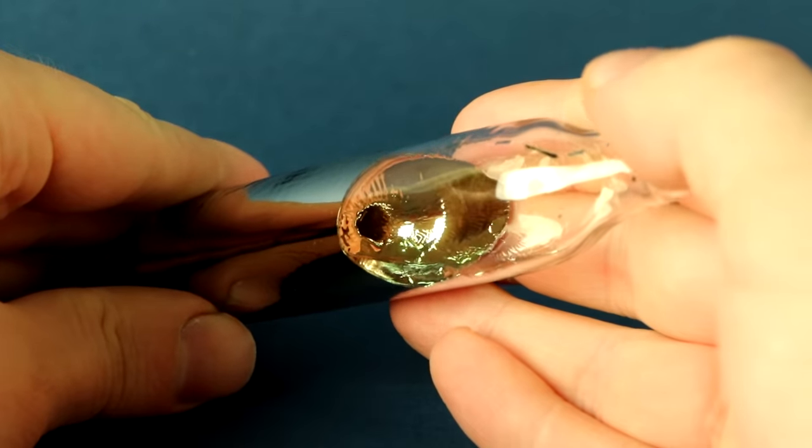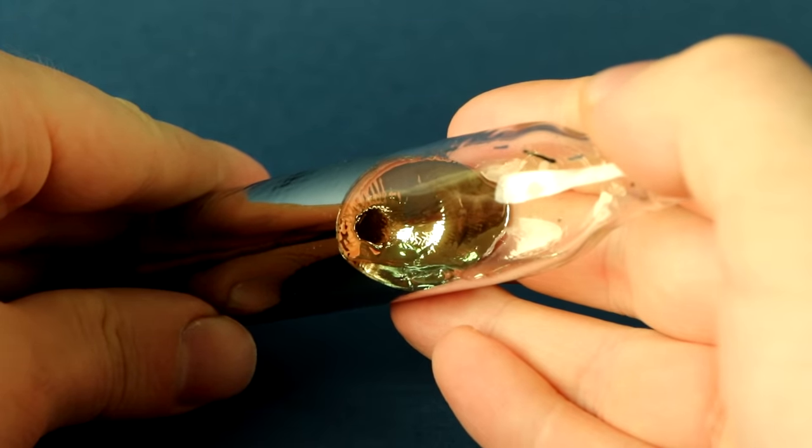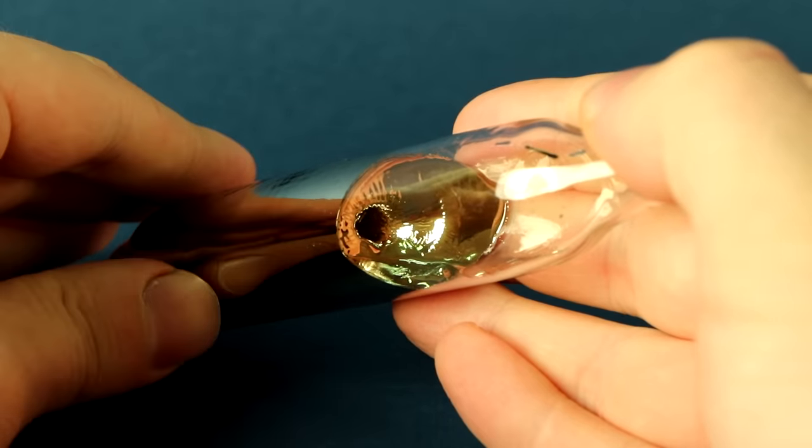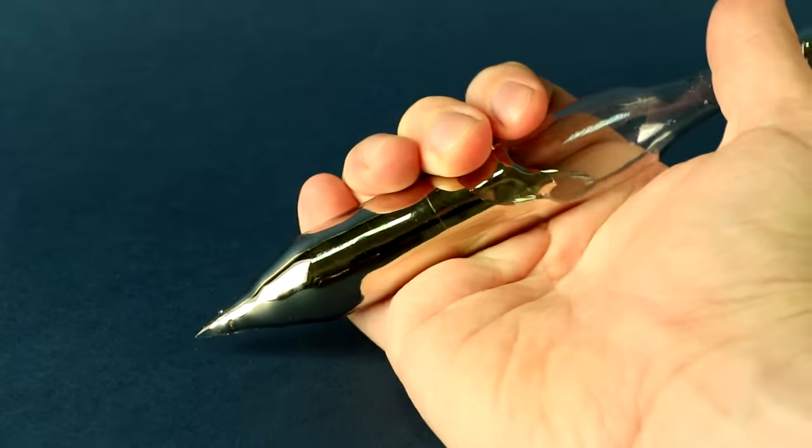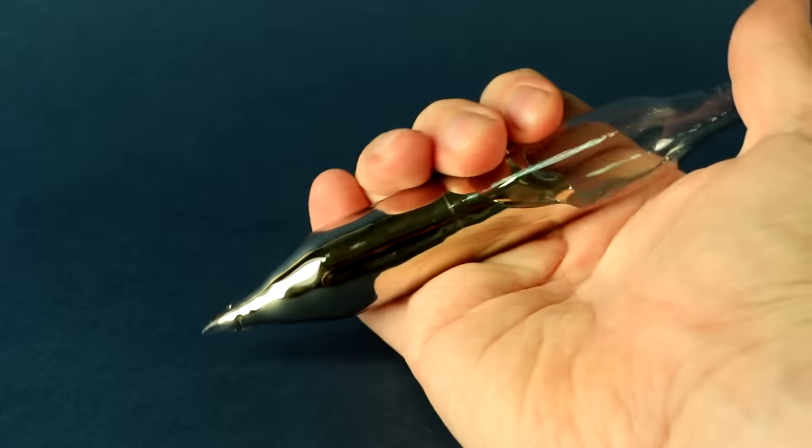Cesium is unusual in that it has a very low melting point – only 29 degrees Celsius. If you take the vial of cesium in hand, you can see how quickly the metal begins to melt.